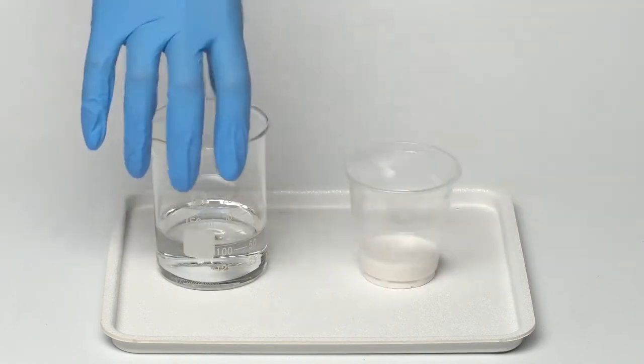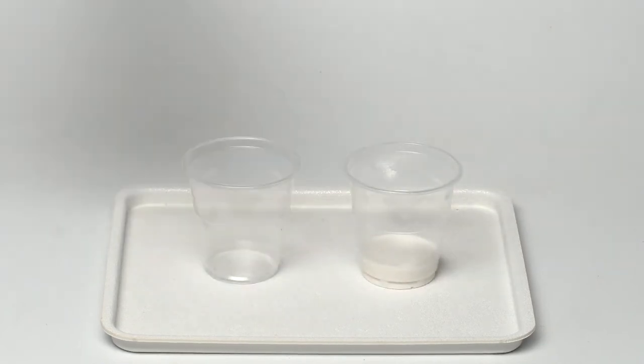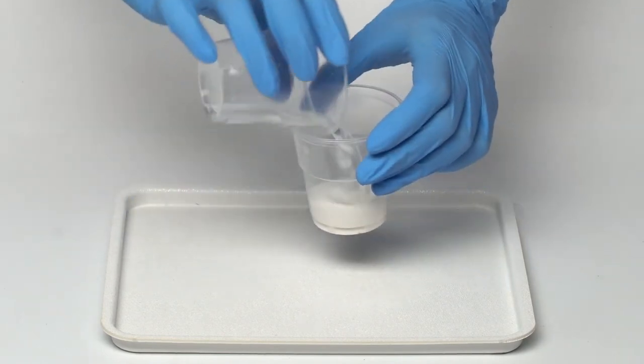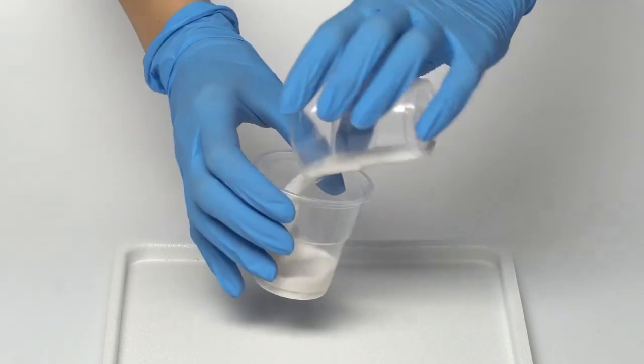Pour the solution of liquid glass into the second cup. Now pour the liquid back and forth from one cup to the other until the mixture solidifies.